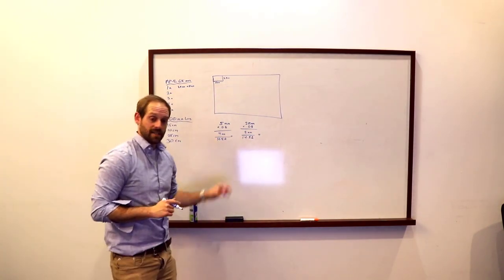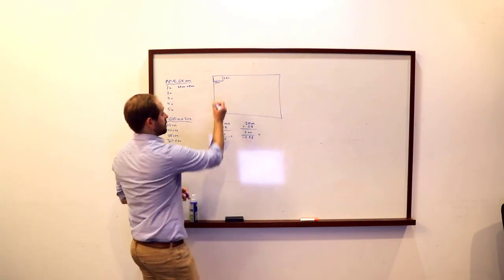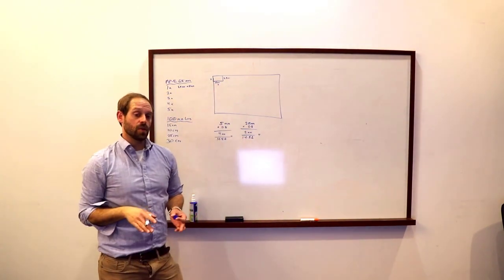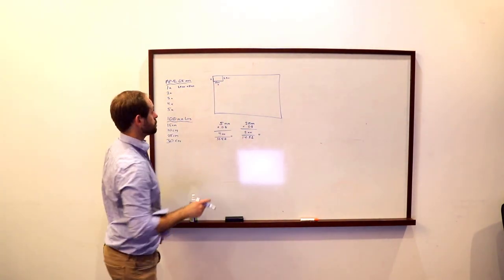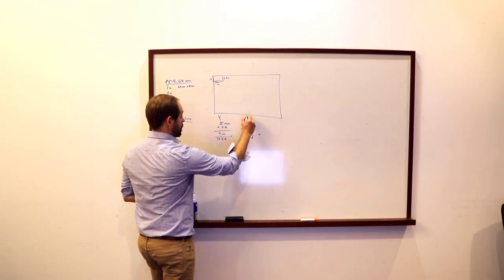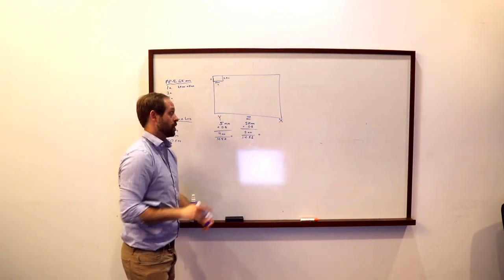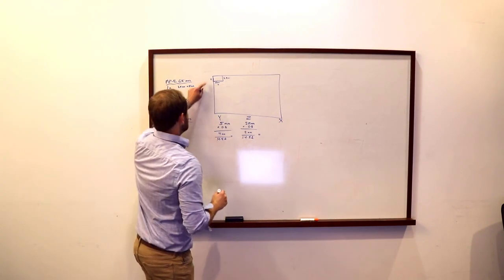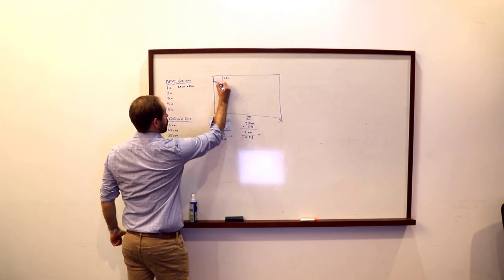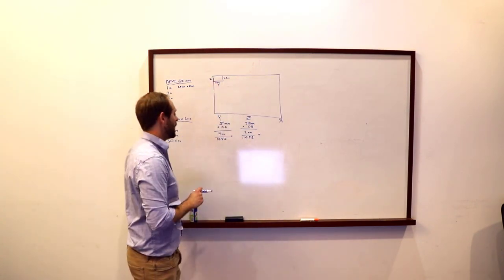Now remember, your long axis, based on the field of view in the camera, is this here. Even though to us that would be considered the x-axis and this the y-axis, in this case we're using the x-axis for focus stacking. So this is actually your y-axis and the short axis is actually your z-axis. Your x-axis is going to be the depth, or the total depth of the field. Not to confuse you, this is your y-axis, and this is your z-axis. I know that does confuse you.